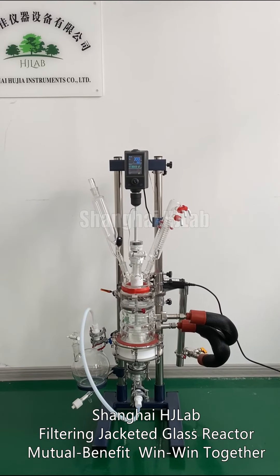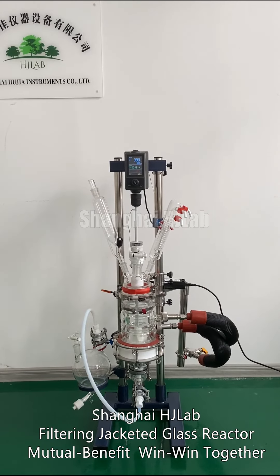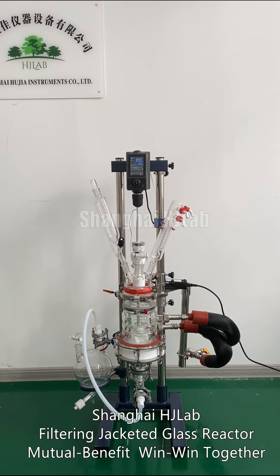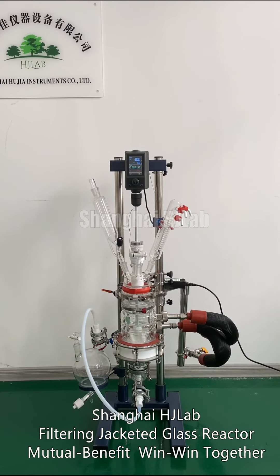Shanghai HG Lab filtering jacketed glass reactor. Mutual benefit, win-win together.